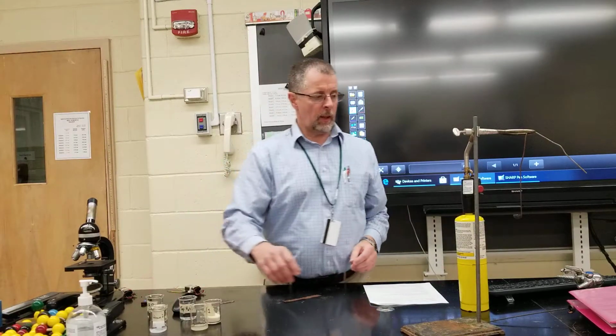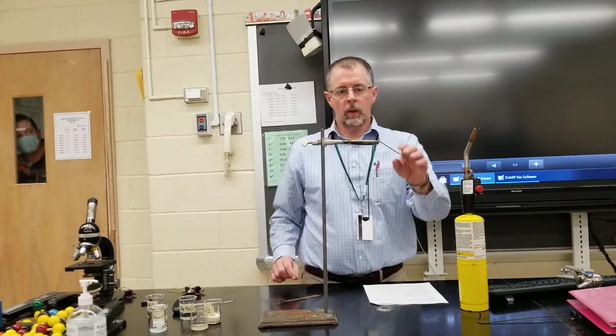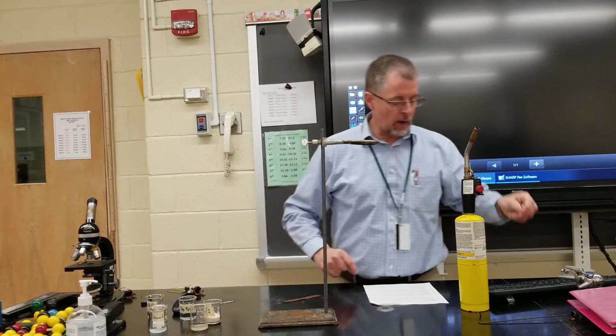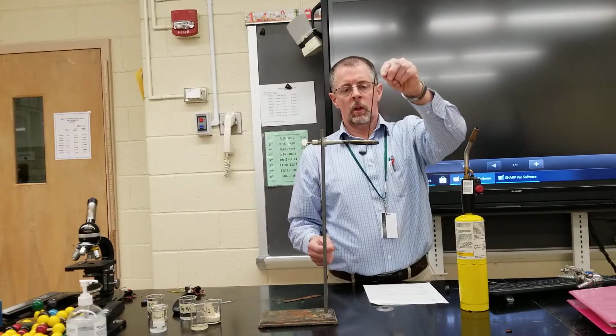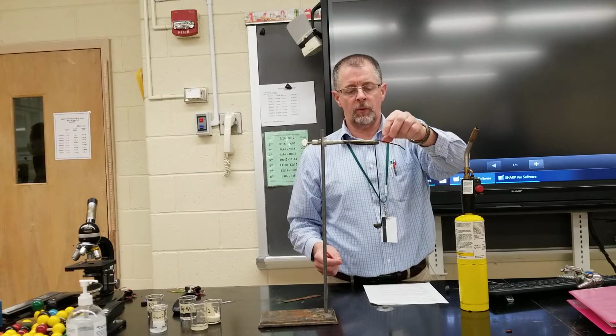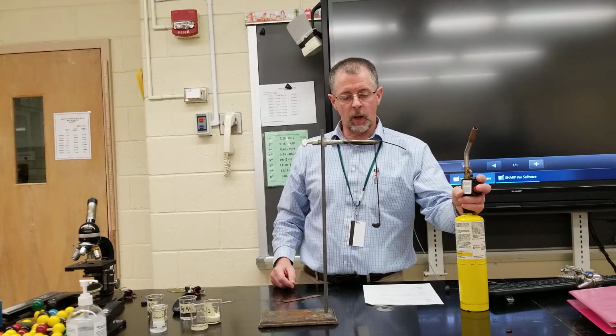And then finally, the last one is we're going to melt these two and see if they produce ions when they're in the melted phase. So again, we'll start with number 1.